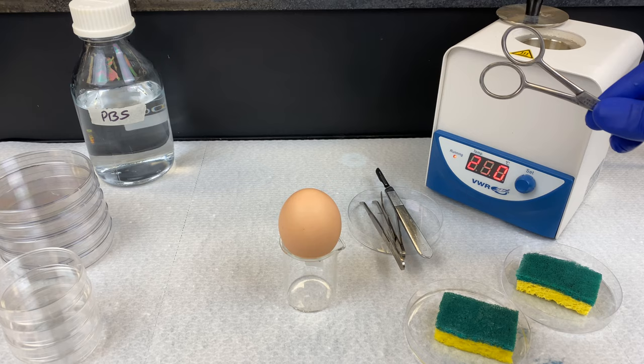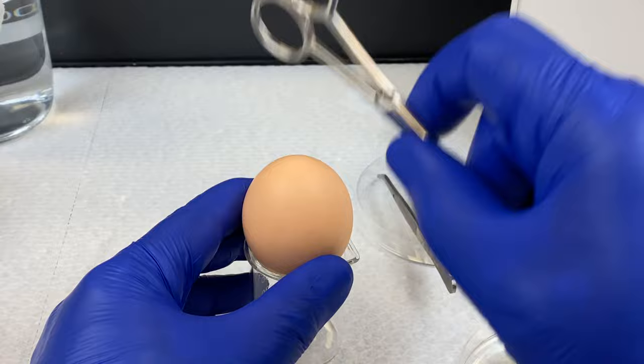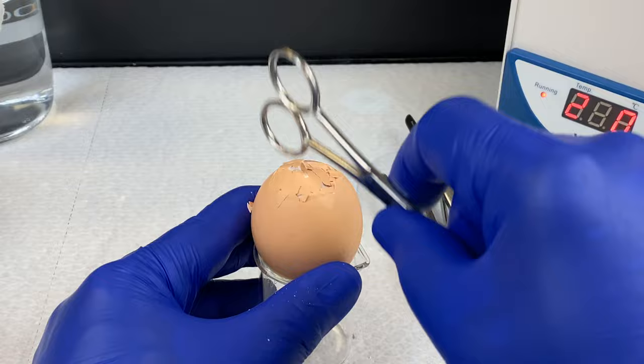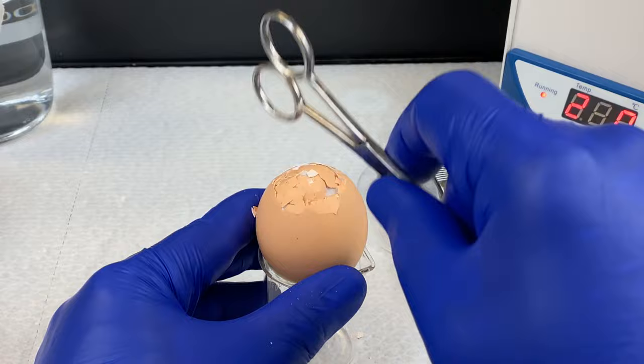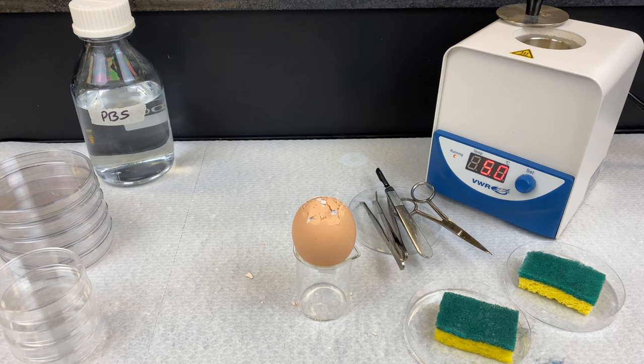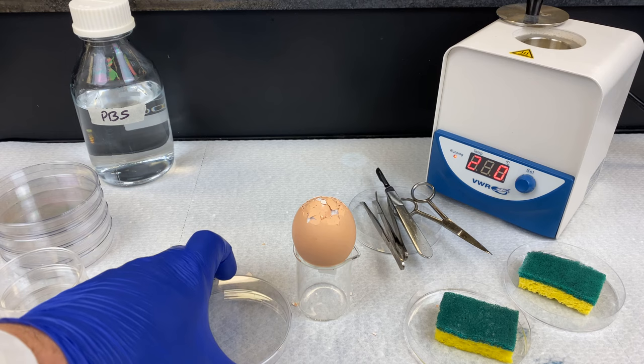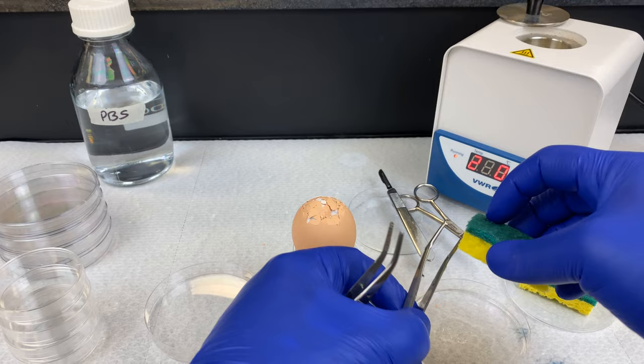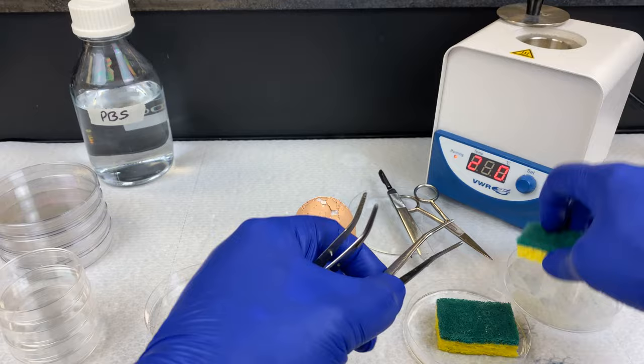Remember, the air pocket area is where we can hit and the shell can dent without leaking out. We're going to hit it so we have an opening about the size of a toonie — a Canadian two-dollar coin — about an inch or two and a half centimeters in diameter. As we crack the egg shell, you'll notice there's a membrane underneath. Once we've sufficiently cracked it open, we want to peel the shell off and then peel off the membrane underneath — the chorionic membrane — using a set of curved forceps. Make sure they're clean and dry.